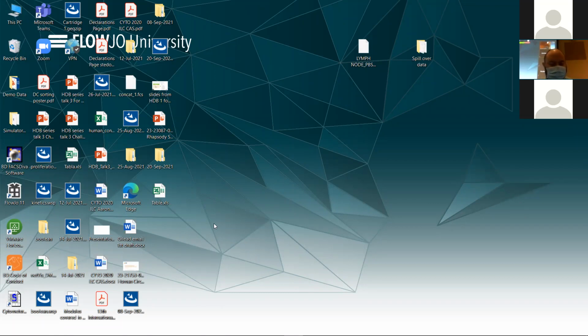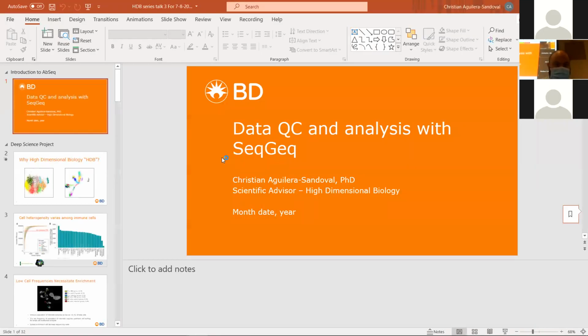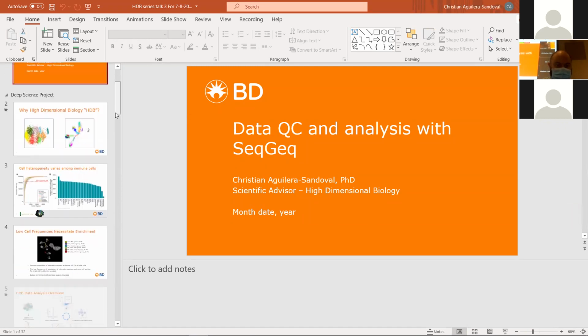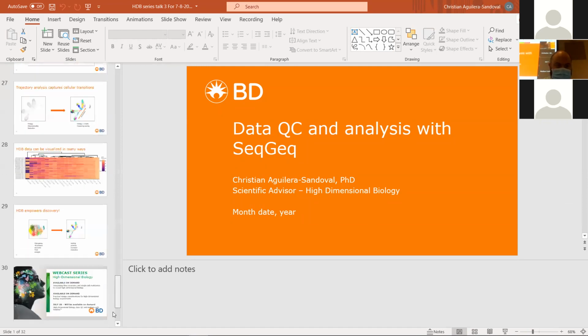So it can be very high, it could be very low. So we maximize the resolution of that target. And if you mark it as critical, we give it extra emphasis to make sure that we resolve that. So if your RO1 that you're working on has that gene or that protein target name, you have to resolve that. And then you might have lesser targets that are still experimental variables that are part of it. And you can put those in as just unknown, and we handle those separately. So there's just the ability to give weighted scoring to those things as you look at it.